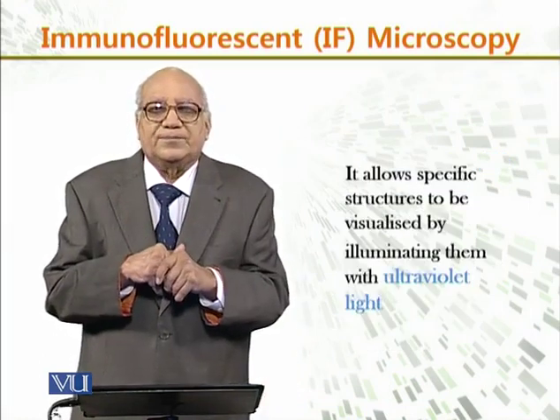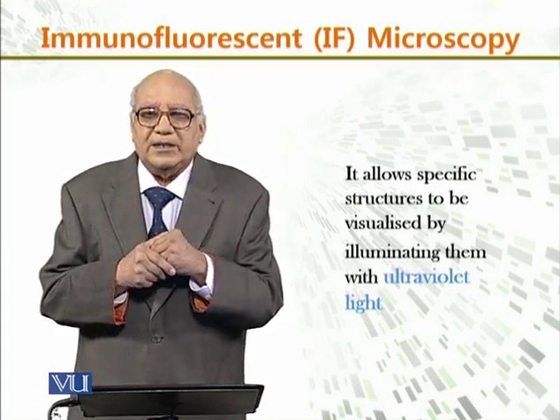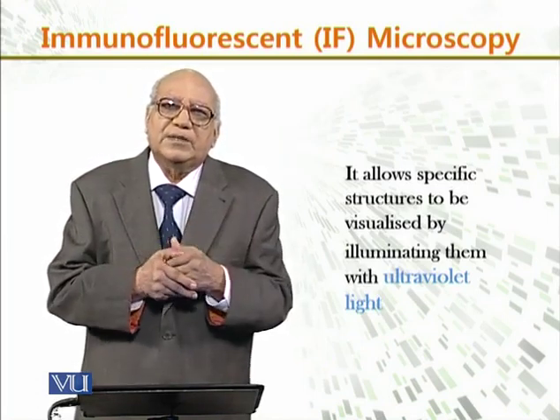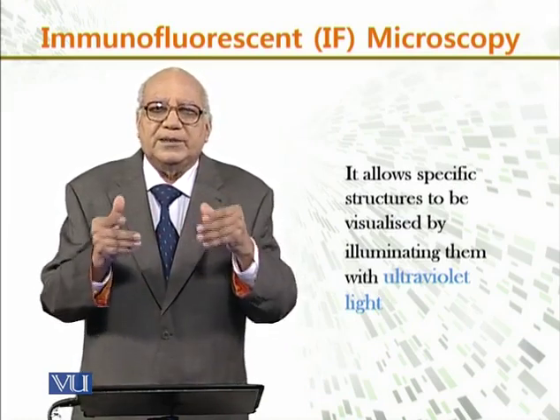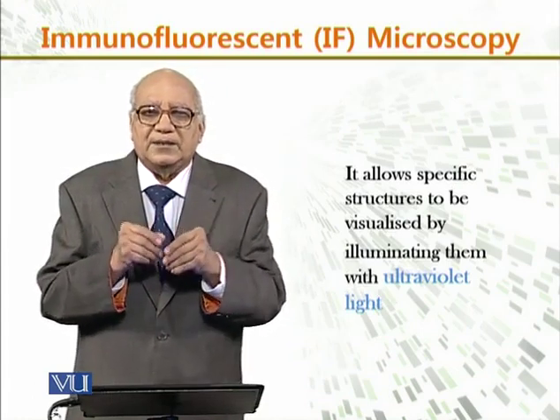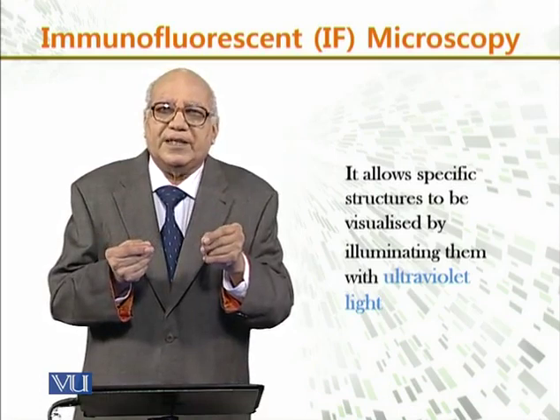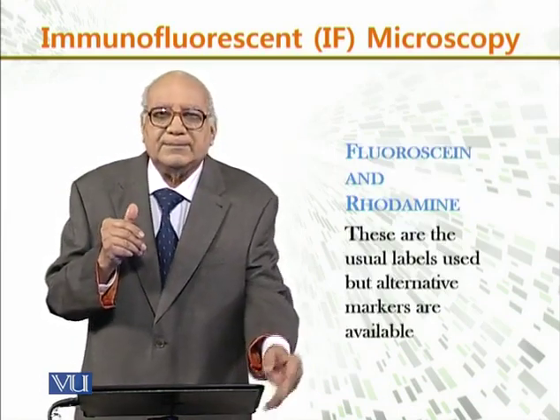Now, it allows the specific structure to be visualized by illuminating them with ultraviolet light. So you see, previously we used spectrophotometry or other things to determine the concentration, but here we can use UV light for illuminating them, as UV light reacts with the fluorescent antibodies.